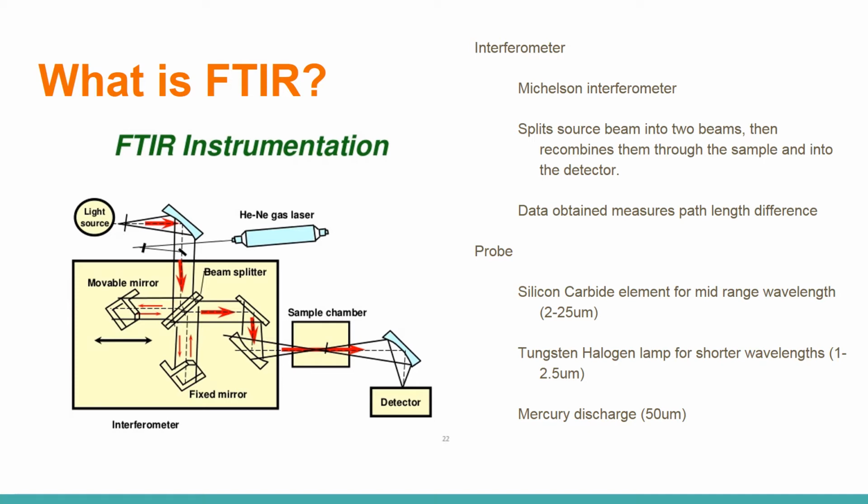And in computer processing, it is required to turn the raw data, the light absorption for each mirror position, into the desired result. The algorithm that does that is called the Fourier transform, hence the name of the technique.